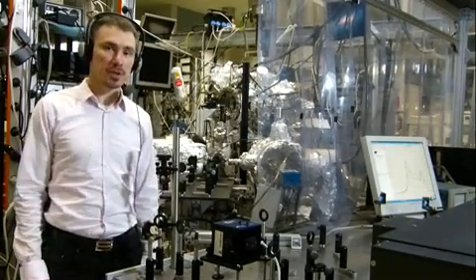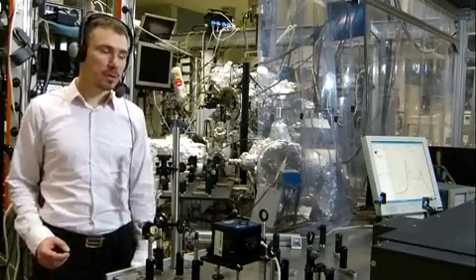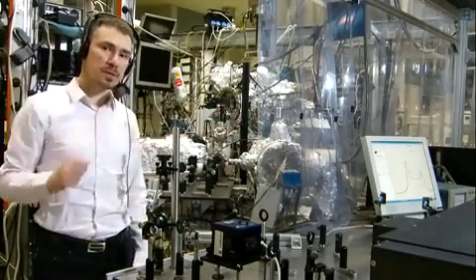My name is Michel Huth and I present our experimental setup for high order harmonic generation. As a driving laser, we use a fiber-based laser system which you can see on this side.